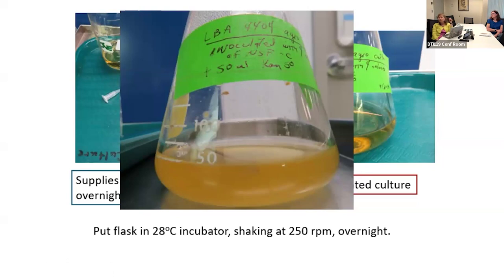I know some people don't measure their OD every time they do a transformation, but for us, that's not what we consider a good practice. So we always read the OD before we do a transformation.